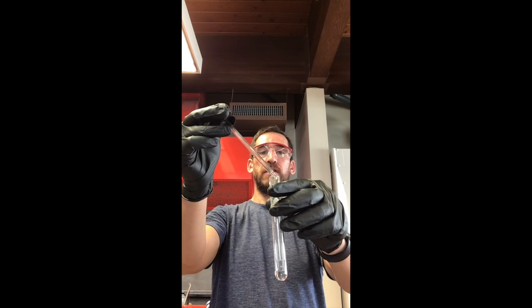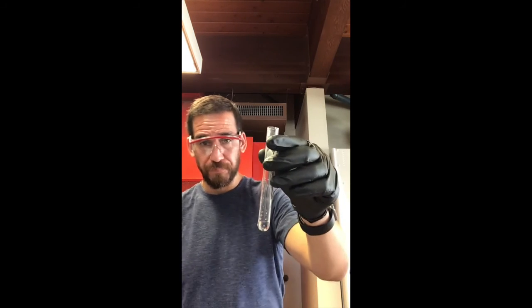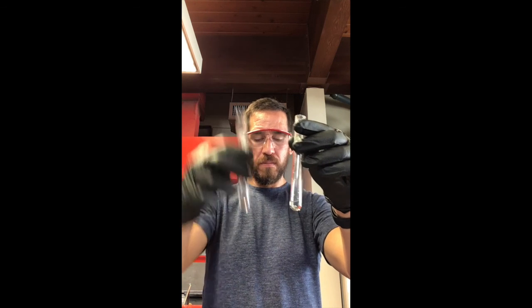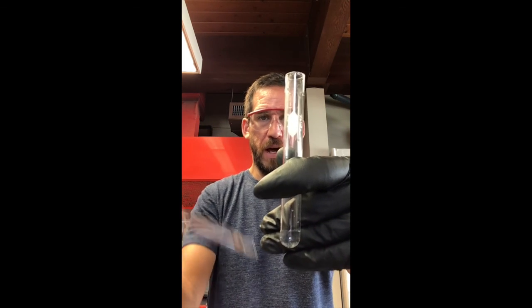1. Yeah, how about that? Let's do 4. Okay, so let's do number 4 in here. So number 4 goes inside of this tube. Okay, now if number 4 were DI water, what would happen if we placed number 2 in it? Okay, so well, here's my old number 2, and if you took notes properly, then you would know that that lower bubble is the number 2. Okay, that's where the number 2 liquid went. So let's take a look at here. See what happens when I add the liquid.